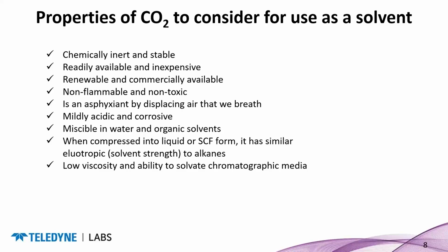Even though we obviously don't want to pump more CO2 into the atmosphere, we're reusing what's already there. It's non-flammable and non-toxic, which is great if you're running chromatography all day. You don't want to be exposed to some of the nasty solvents that we get with standard normal phase or reverse phase flash or HPLC. One of the downsides is it is an asphyxiant by displacing the air that we breathe, so you do have to use ventilation.